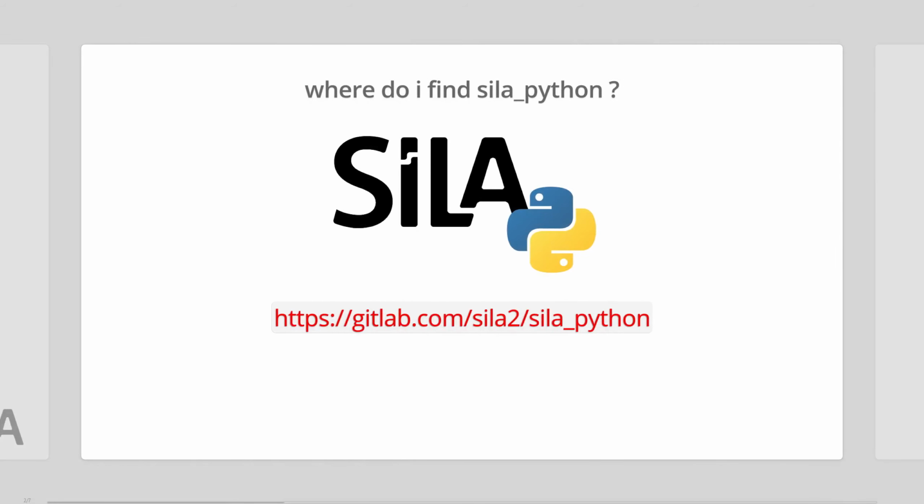Everything can be found on our GitLab repository, the SiLA Python repository. Just follow this link and you can see all the documentation, all the source code you need.